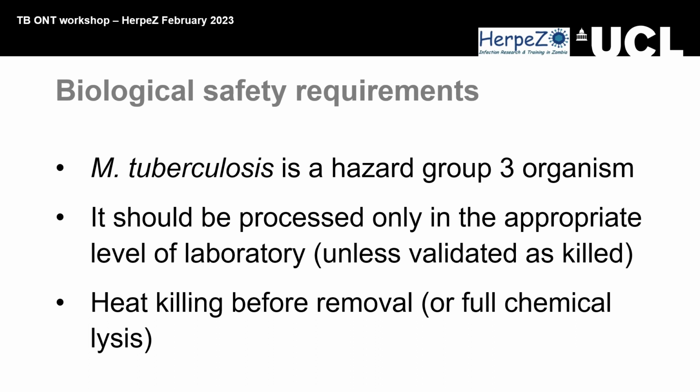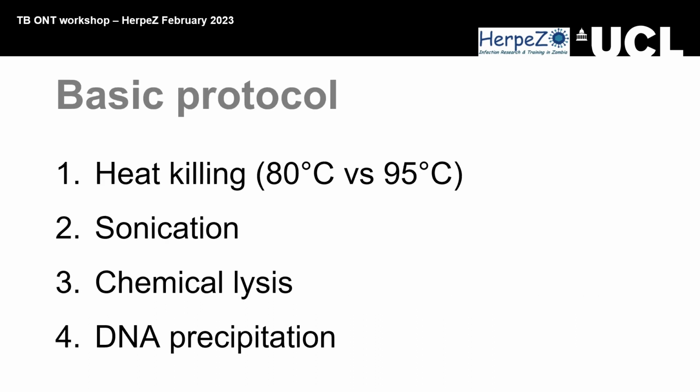Yeah. So for us, we're heating at 80 degrees Celsius for 30 minutes, which is high enough and gentle enough not to break the DNA. Then sonication, chemical lysis, and precipitation.